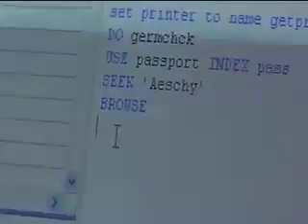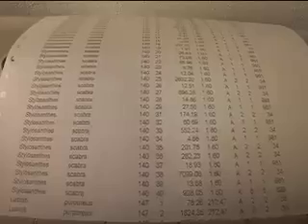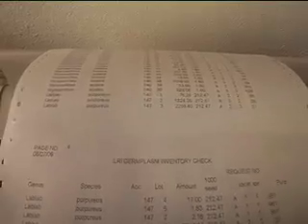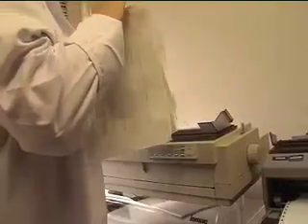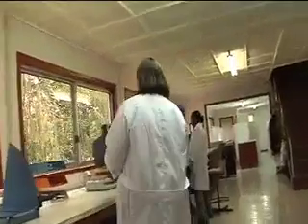The next thing I'm going to do is the seed request. Some seed requests are very specific and ask for samples of a list of accessions. Others are more general, and crop experts usually determine which accessions best meet the needs of the user. Once the list of accessions is selected, the inventory is checked to see if the request can be filled. A list of accessions and their location is printed out so that the seeds can be prepared.